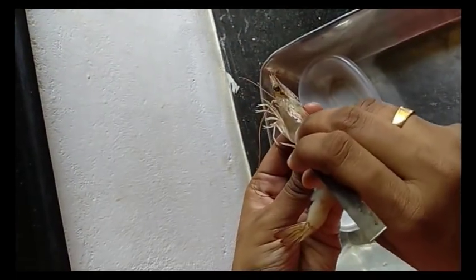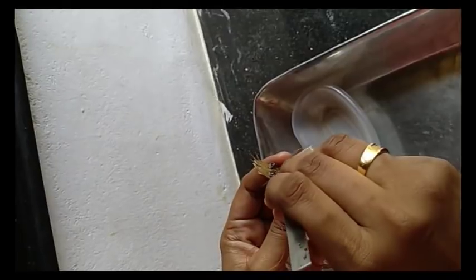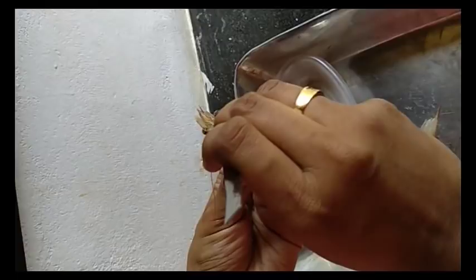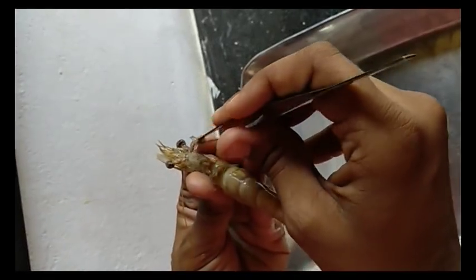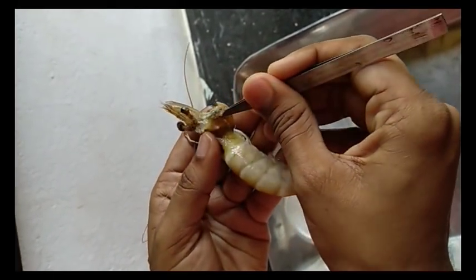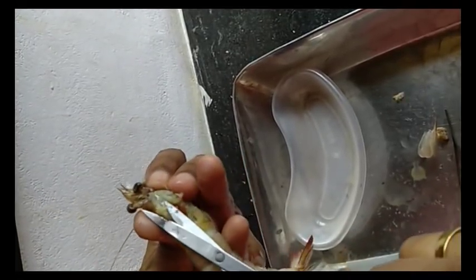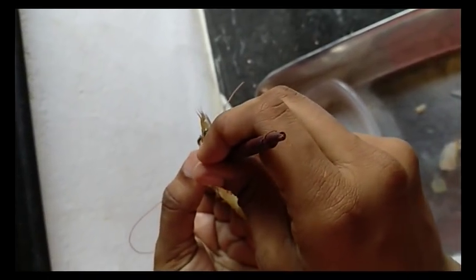So first we have to remove the carapace. The carapace is removed, and below that, the skin below that is removed. Okay, here you can see the brain.